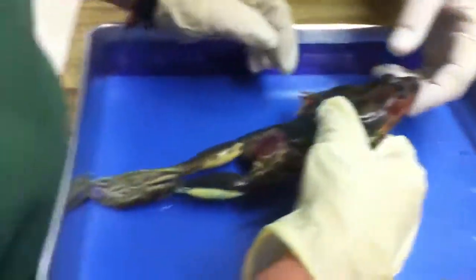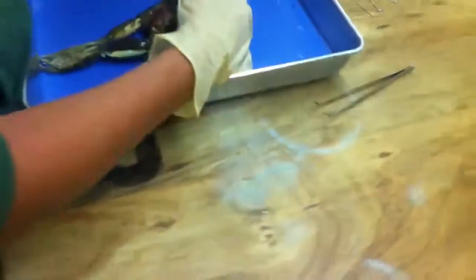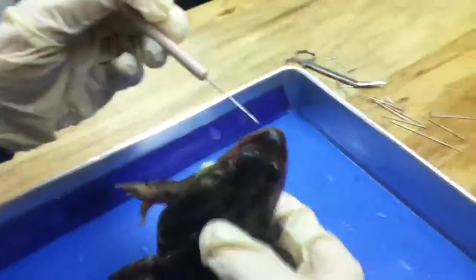Use figure 2 to locate and identify the external features of the head. Find the mouth, external nares, tympani, eyes, and ears. Okay, so here's his ears.